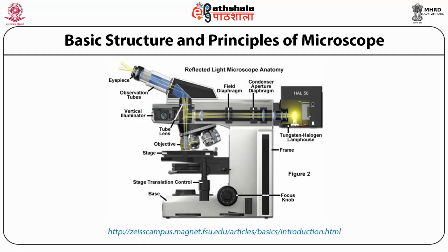So here is a brief outline, or schematic, of a fluorescence microscope. In this, you have a stable frame, which is the reverse L-shaped frame. Then you have the light source plugged in on one end. It could be tungsten, halogen, LED, anything. It throws the light, and the light passes through the condenser, and then hits the dichroic mirror, through which it goes to the objective lens and illuminates our sample.